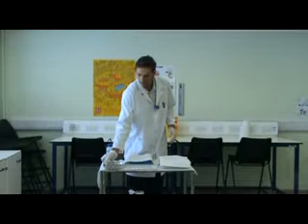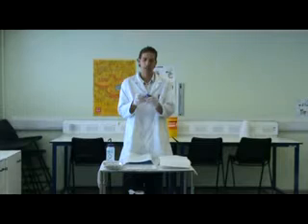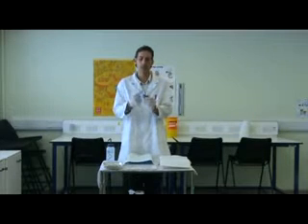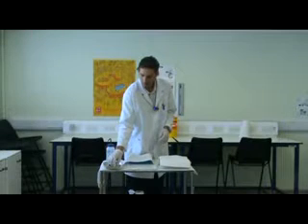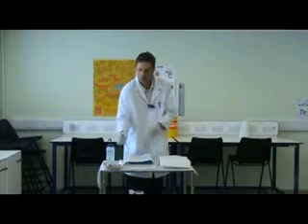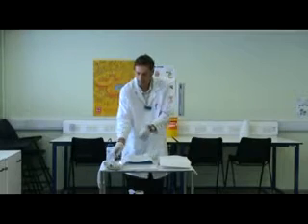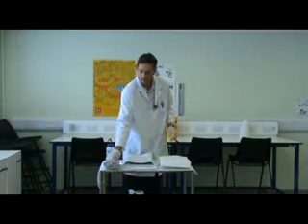We've also got a variety of forceps, a fine-tipped and a blunt-ended pair of forceps. We've got a pair of dissection scissors, and we've also got a pair of clamp forceps, and finally a scalpel.